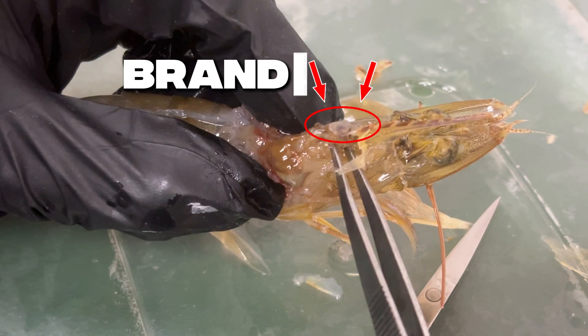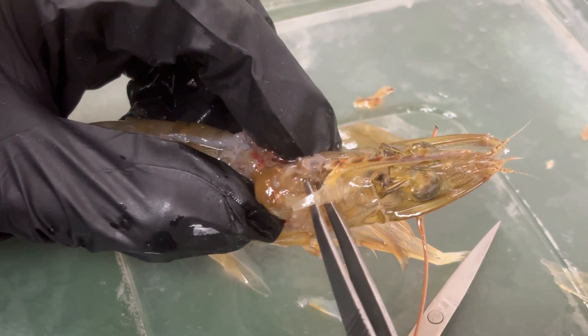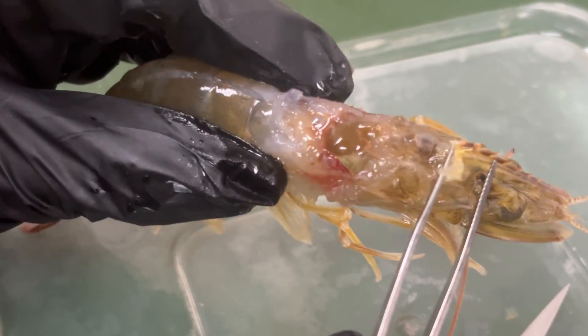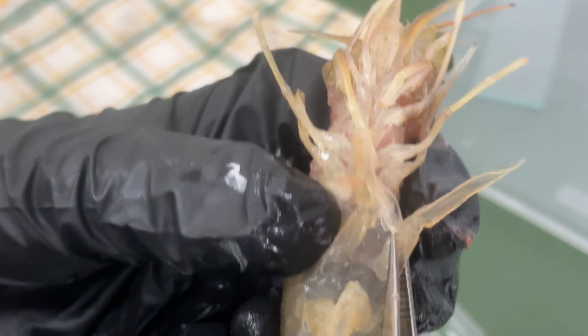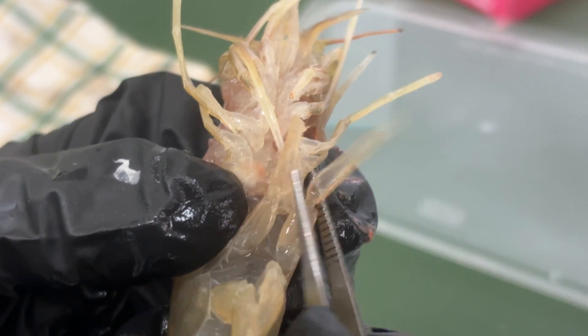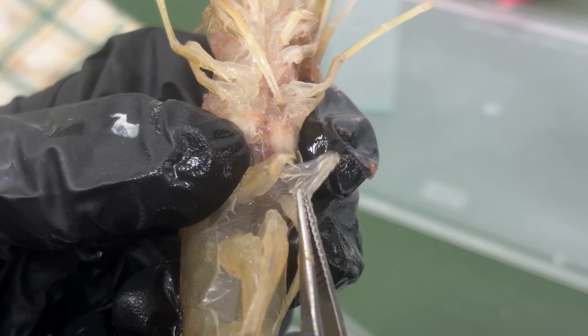The shrimp brain is small but essential. It is located behind the eyes, above the esophagus, and is sometimes called the supraesophageal ganglion. This is a male shrimp — you can see the petasma, a tubular structure used for reproduction.